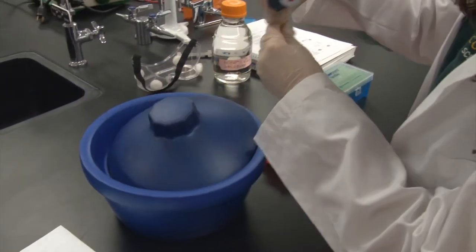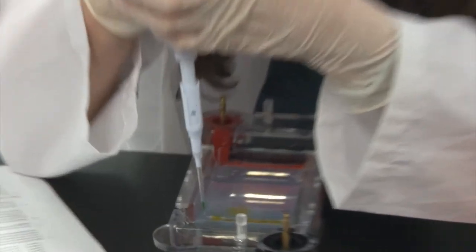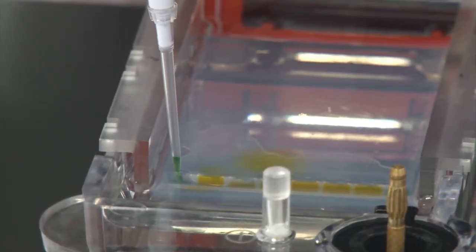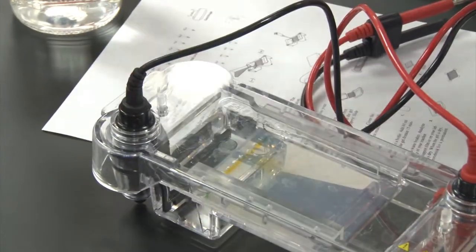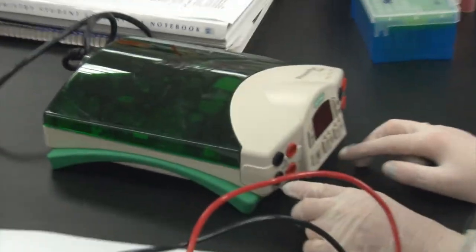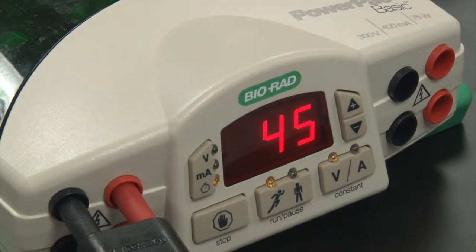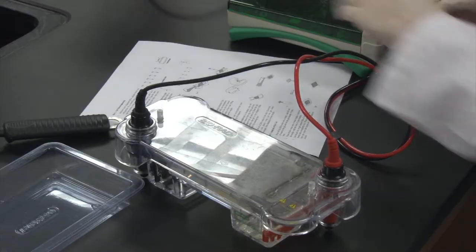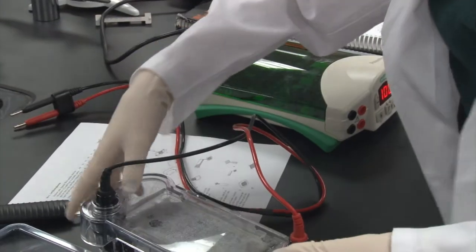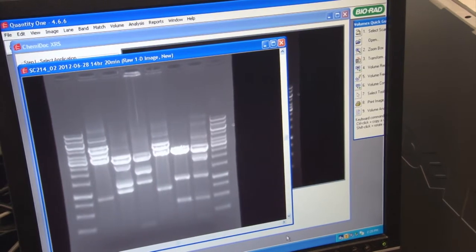Add 5 microliters of loading dye to each sample. Add 20 microliters of sample to each well. Run the gel at 100 volts for 45 minutes. View your gel on the gel dock.